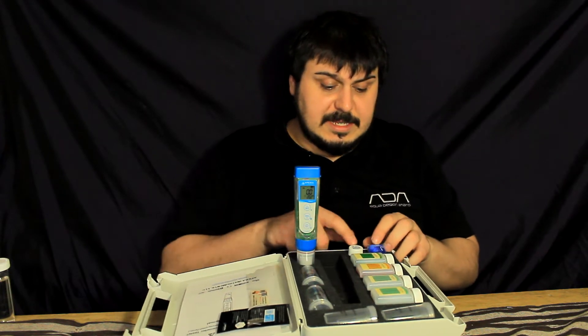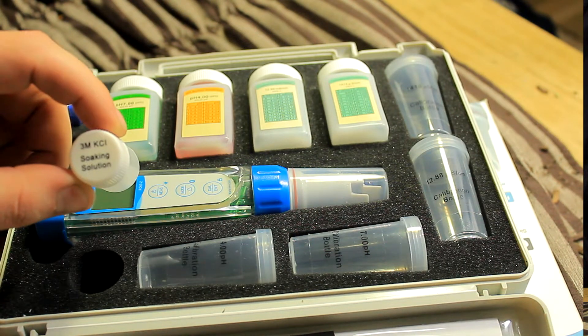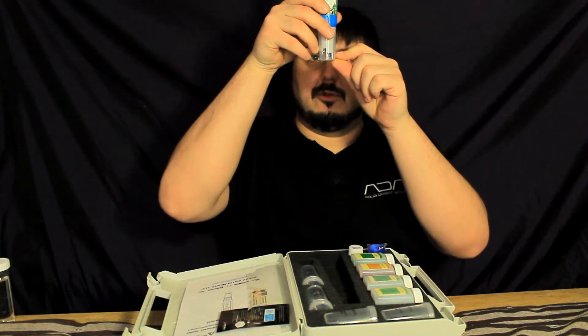The next thing you're going to see is the 3M soaking solution. What you want to do is pour about half of this into the cap to a certain line, and you're going to want to soak your pH probe, which is the blue probe you see here.